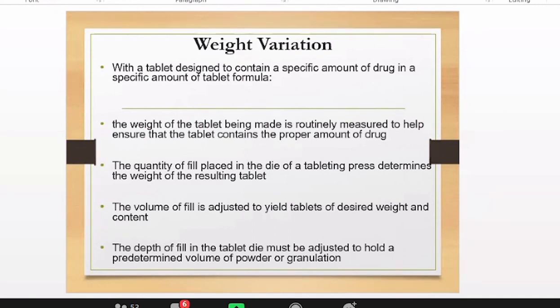When you assess the disintegration of those 12 additional tablets, you must stick to the rule that at least 16 out of the total 18 tablets tested must disintegrate. If you've got 16 of them disintegrating, then that batch will have passed the disintegration test.